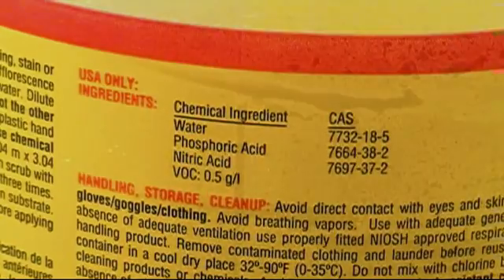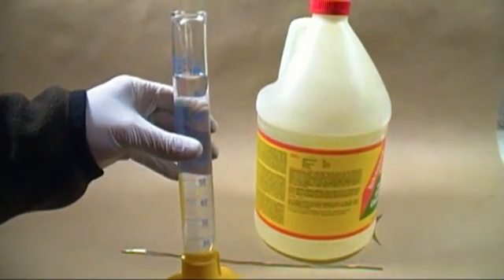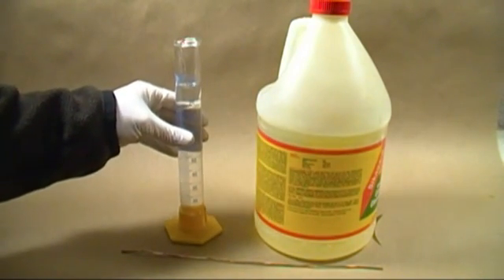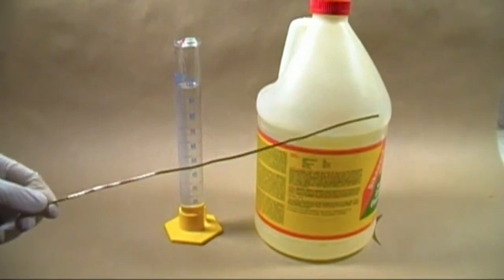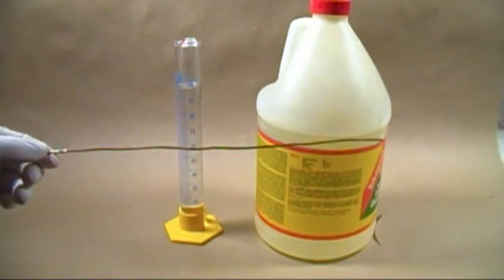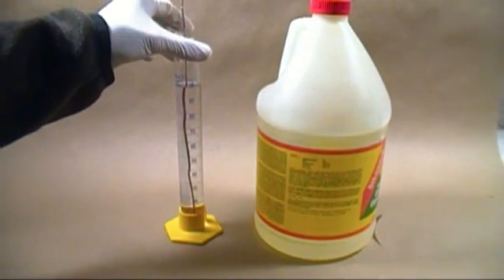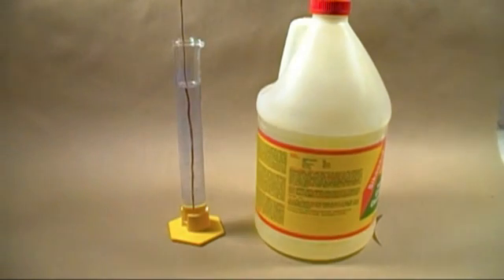Since the label doesn't tell us the amount of nitric acid in the bottle, we need to determine if it's even worth the effort to distill it. I poured out 100 milliliters of this solution into a graduated cylinder. We need something that can react with the nitric acid but not the phosphoric acid. Copper works great for just this purpose — it will only react with the nitric acid and gives a blue compound, copper nitrate, that colors the solution, providing a rough estimate of nitric acid concentration.